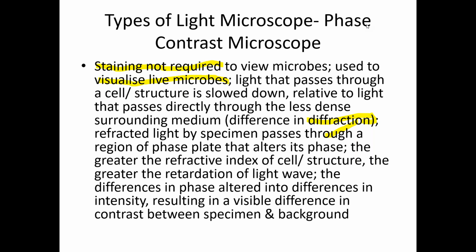There was a special structure in the dark field microscope. Due to that structure, only light which is reflected by the specimen will enter the objective lens in dark field. While we studied dark field microscopy, I told you about a structure or a fitting or a special aid on the dark field microscope.